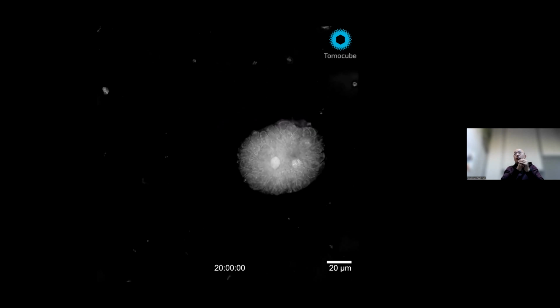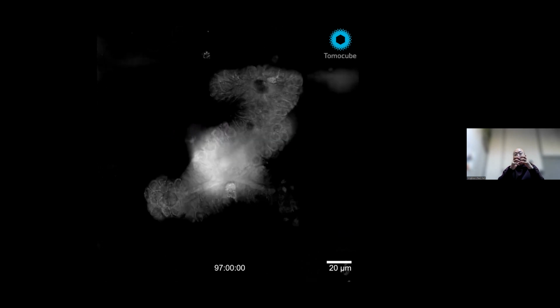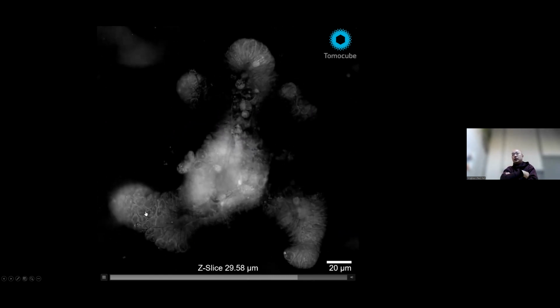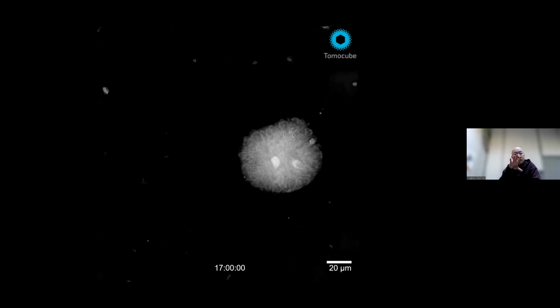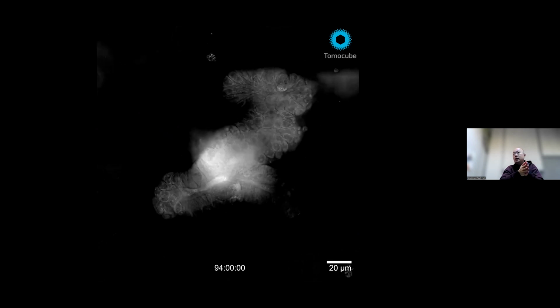But we have several limitations as well. Currently, our penetration depth is limited to 150 micrometers, which means if your sample is thicker than 150 micrometers, you may have some blurring effect like that. This is one of the limitations of the current commercial system. Nonetheless, small organoids smaller than 150 micrometers in thickness can be measured without changing any protocols, without any sectioning, refractive index matching, or clearing.